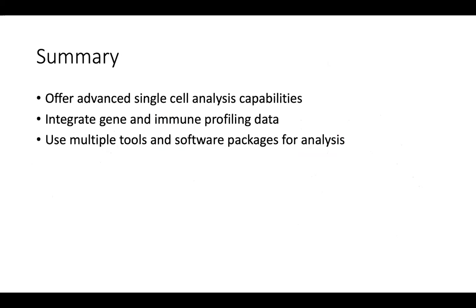So I've just quickly run through some of the analyses we've done. I hope that was helpful to all of you. And just to summarize, we offer these pipelines to pretty much all single cell gene expression and immune profiling data sets. And our ability to integrate both expression and immune profiling data, I think, is pretty powerful. We use a number of different tools for the analyses and visualization. And so I think that is where our advantage really is. Yeah, so I can stop now and take any questions.